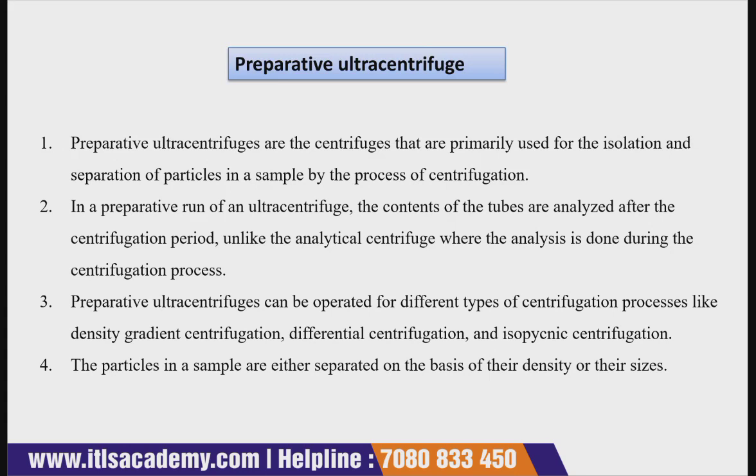Now moving to the next type, that is the preparative ultracentrifuge. Preparative ultracentrifuges are primarily used for the isolation and separation of particles in a sample by a process of centrifugation. In a preparative run of the ultracentrifuge, the content of the tubes is analyzed after the centrifugation period, unlike the analytical centrifuge where the analysis is done during the centrifugation process.